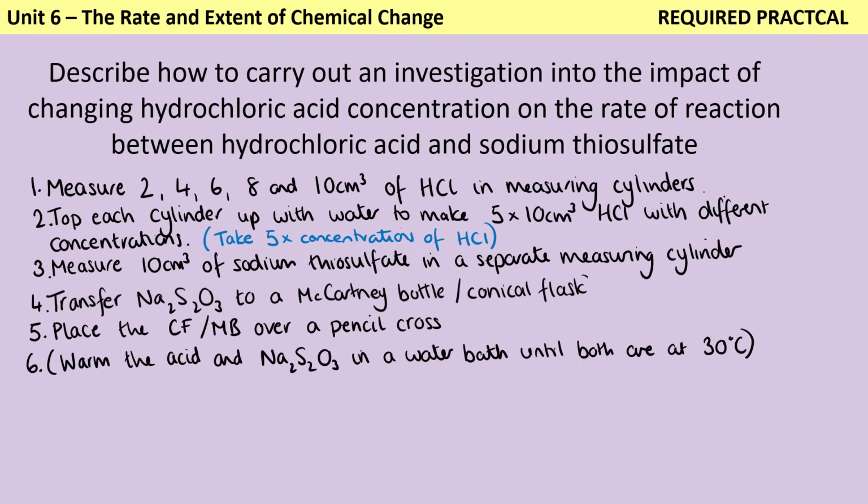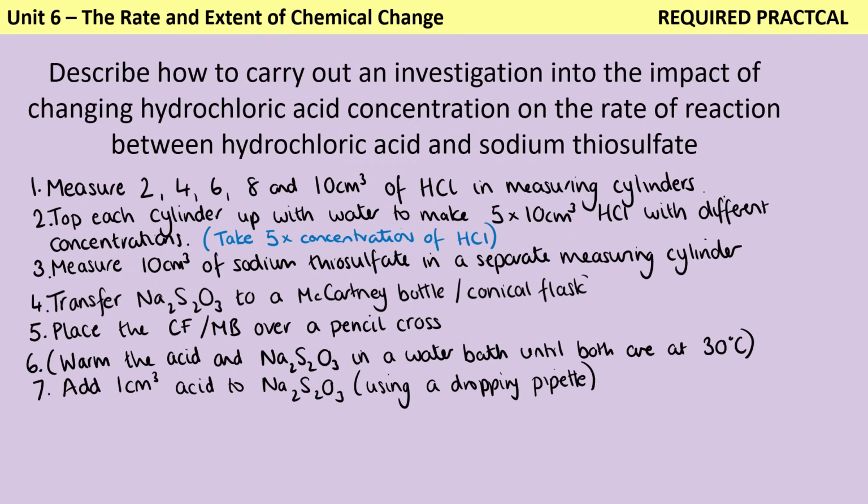You might describe how you're going to warm them so that they're at a particular temperature, but you only need to do that if you're using that as a control variable. And to be honest, there are enough other control variables in this reaction that I probably can just omit that. Then I'm going to add the acid to the sodium thiosulfate.